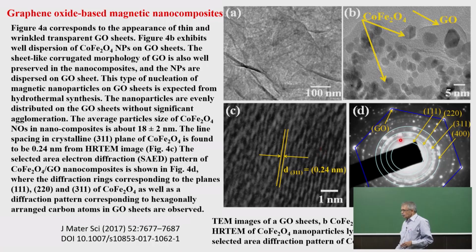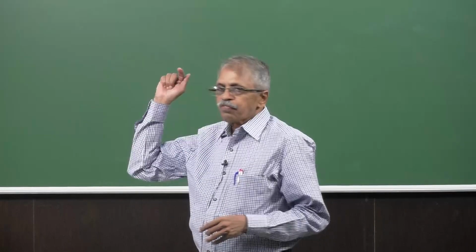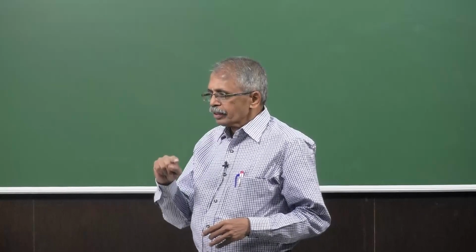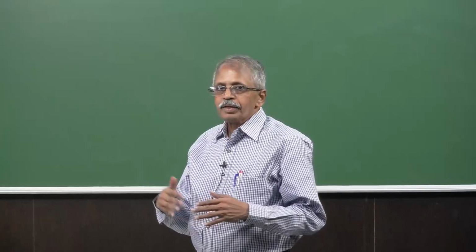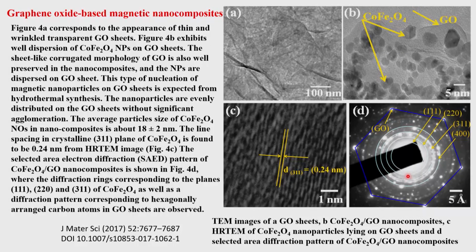Now you can also choose a small region in this particular thing and focus the electrons on that and collect the diffraction pattern. I already explained this when we started microscopy, the electron diffraction, and we have already seen the powder diffraction, the X-ray diffraction.